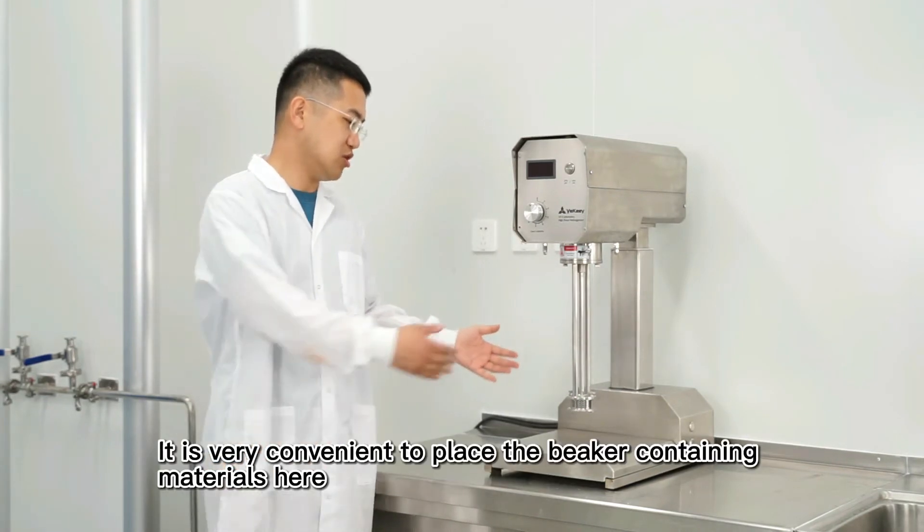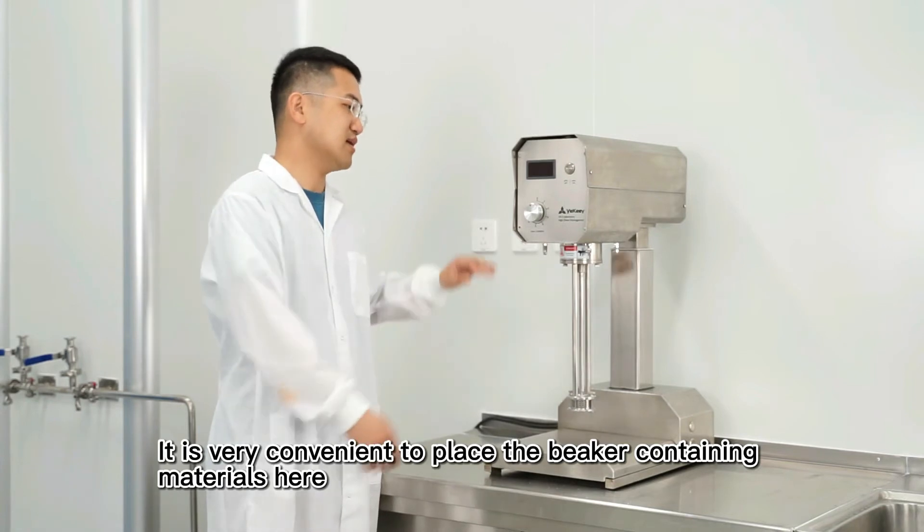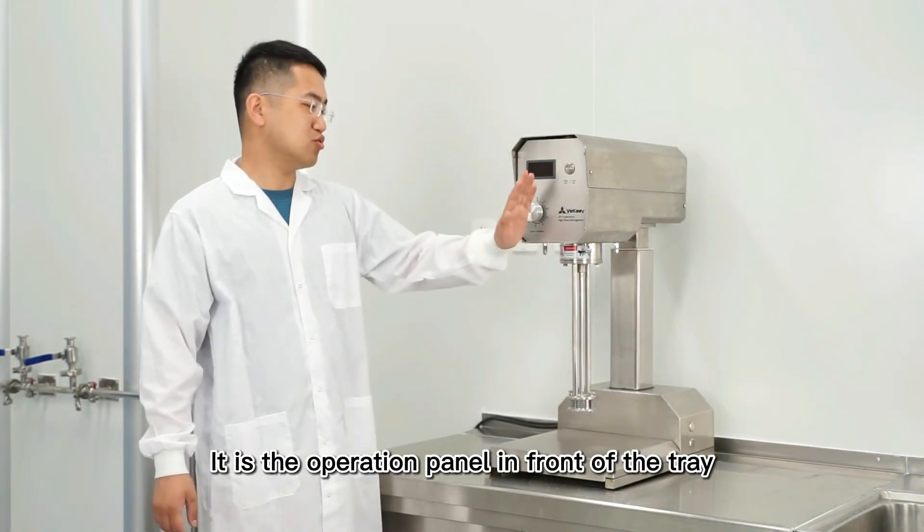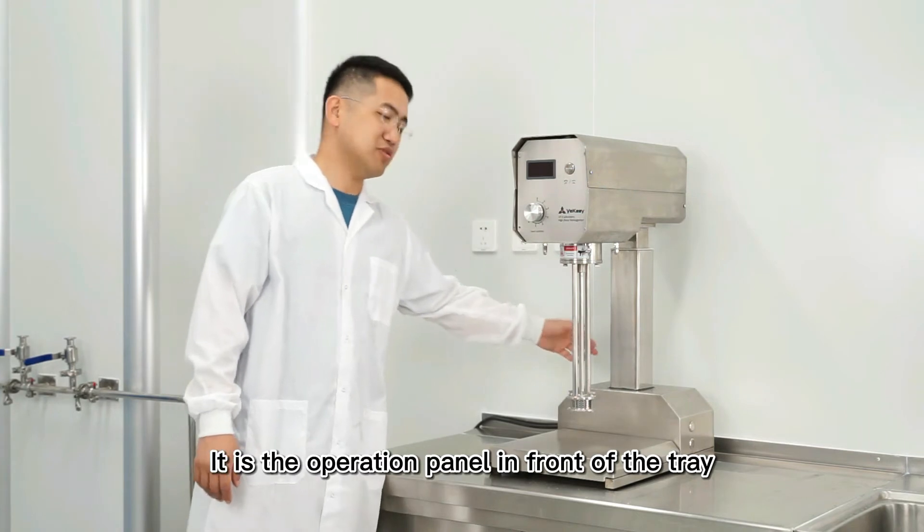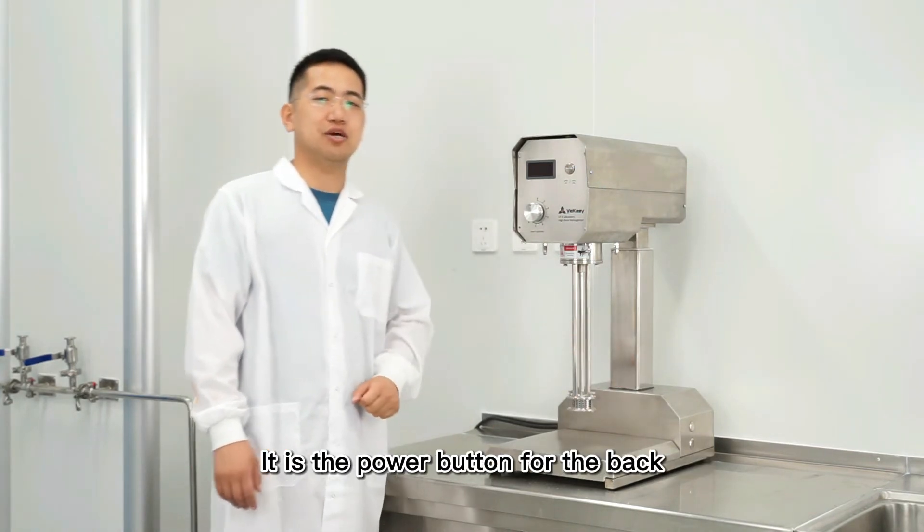It is very convenient to place the beaker containing materials here. The operation panel is in front of the tray, and the power button is at the back.